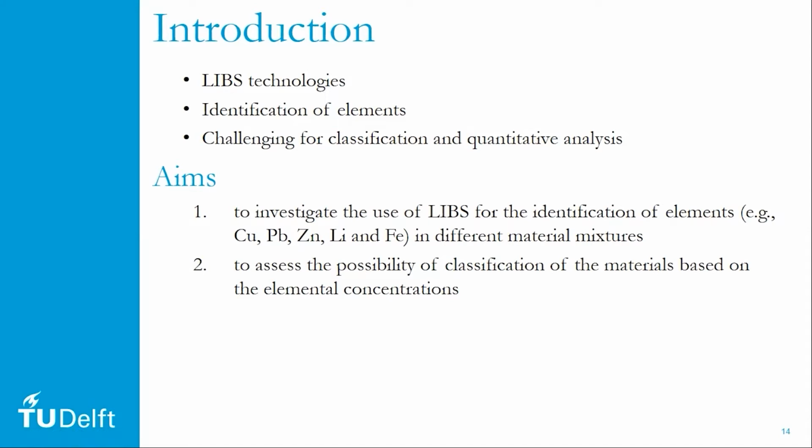However, as is the case for most other technologies, quantitative or semi-quantitative analysis of elements using LIBS is challenging. So the aim of this study is to investigate the use of LIBS for the identification of elements in different material mixtures. And the other objective is to assess the possibility of classification of materials based on the elemental concentrations.